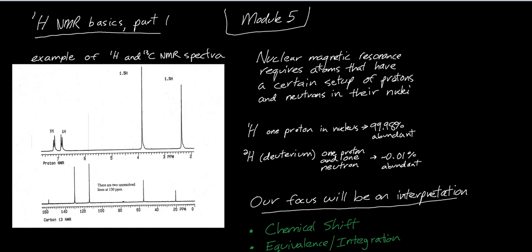This is the first video on NMR spectroscopy, the main technique that we're going to be talking about in the unit on spectroscopy. I have an example of a proton and carbon NMR spectrum here. Spectrum singular, spectra plural. And you can see the shapes of the peaks.